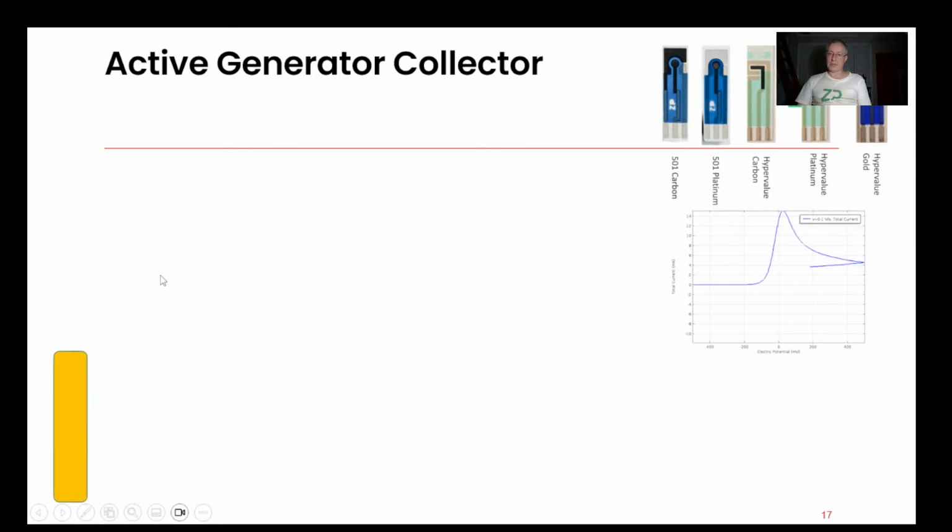Now what they're describing is a generator collector mode. So what is going on here? What are we all talking about? Okay, so I've got this electrode and I've got some ferrocyanide on there, and I oxidize it to ferricyanide. I know that approximately the oxidation potential is about 100 millivolts versus the reference, because I did a quick cyclic voltammogram on that earlier on.